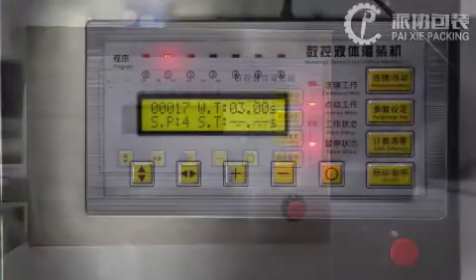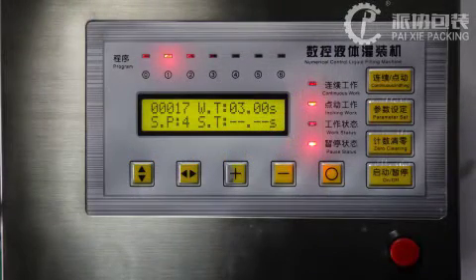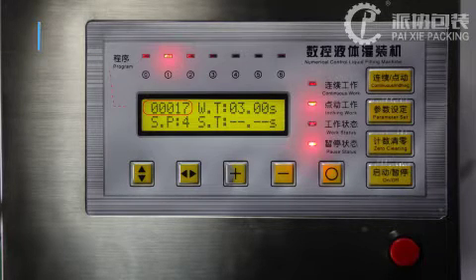This is our numerical controlled liquid filling machine from Paixie. Let's see the screen. This is count.